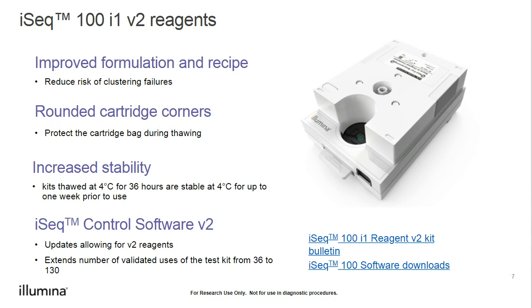But I do really recommend moving to the V2 reagents. The improved formulation here is really critical to getting more frequently good runs out of these reagents. So really excited about those changes made.